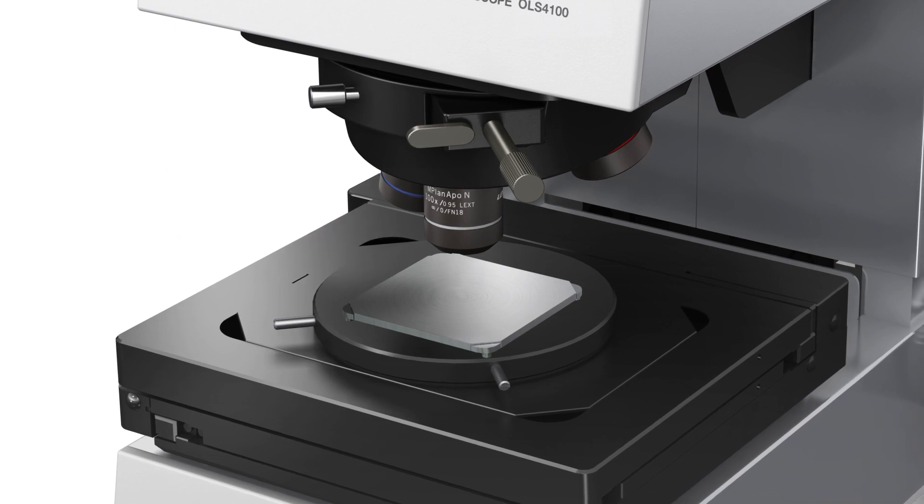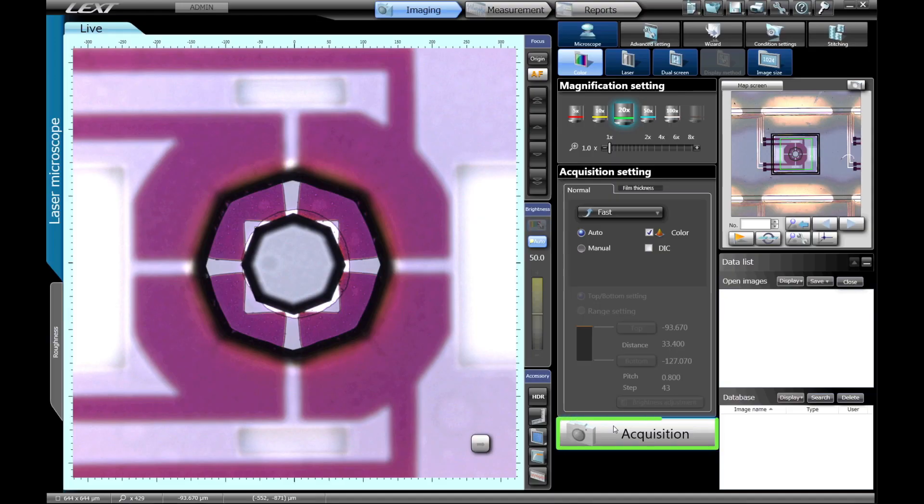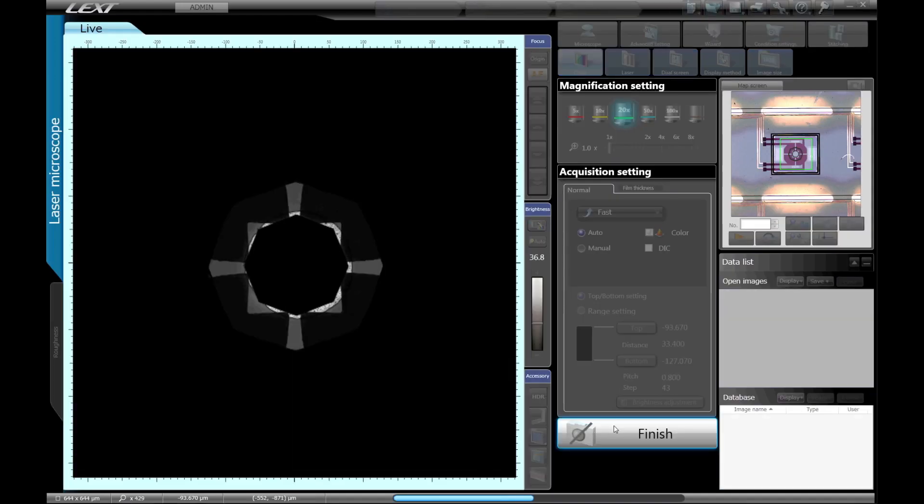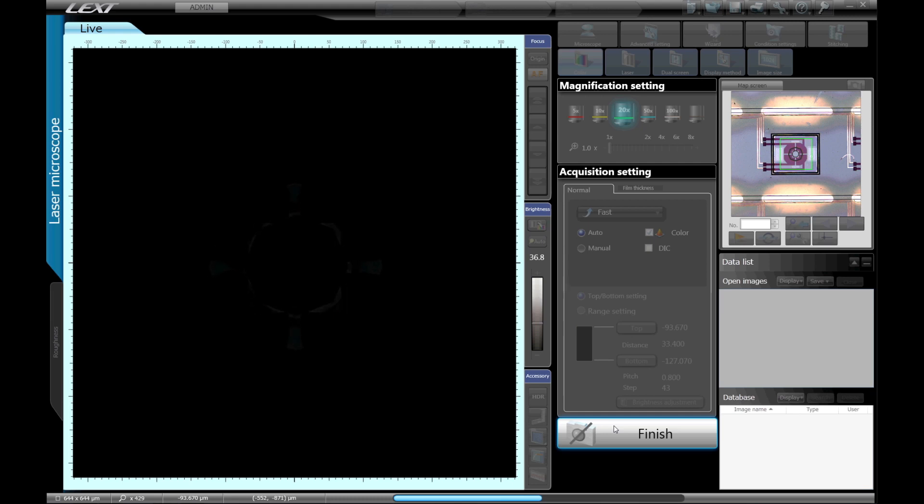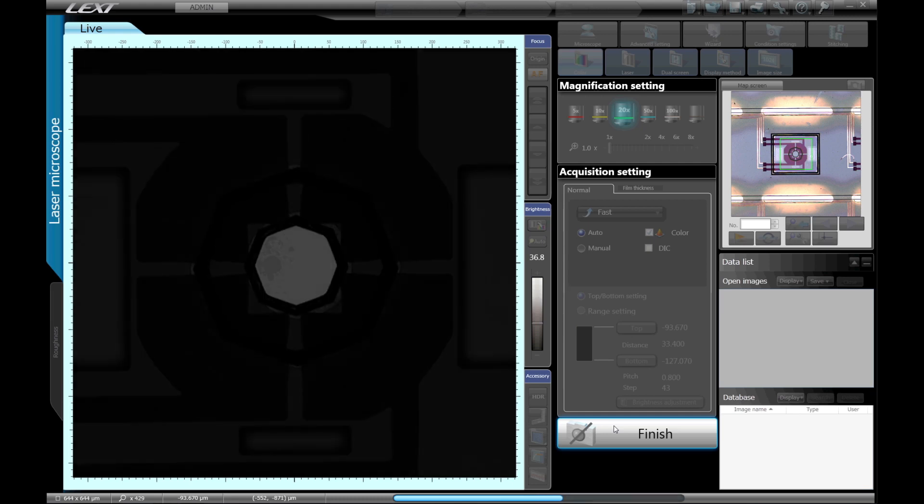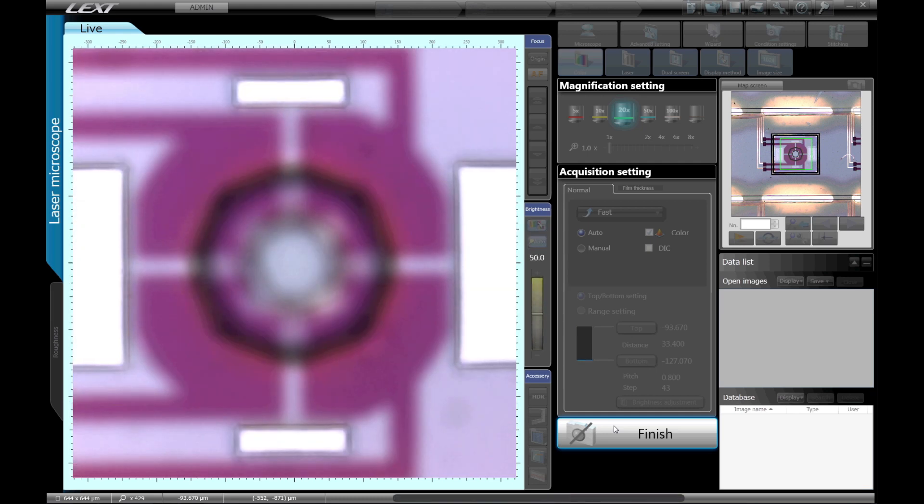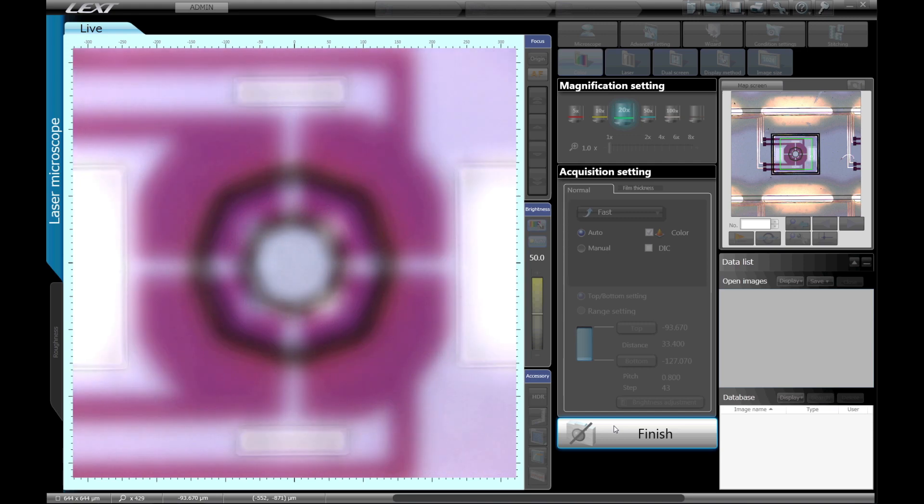Just place the sample on the stage and press the acquisition button. LEXT automatically sets the upper and lower limits and brightness, so it's simple for anyone to acquire images and obtain consistent measurement results.